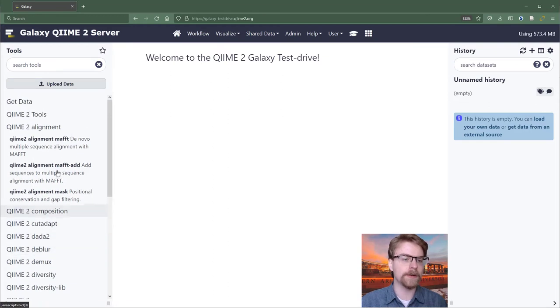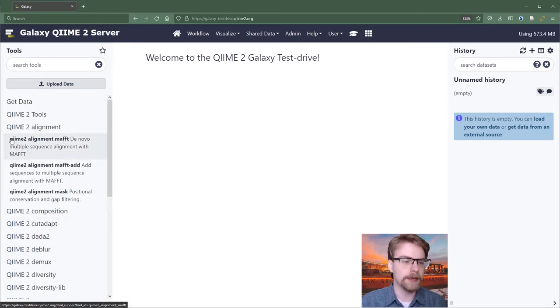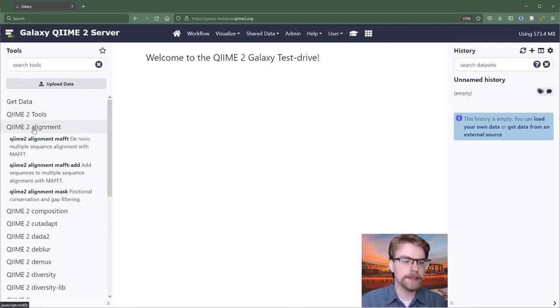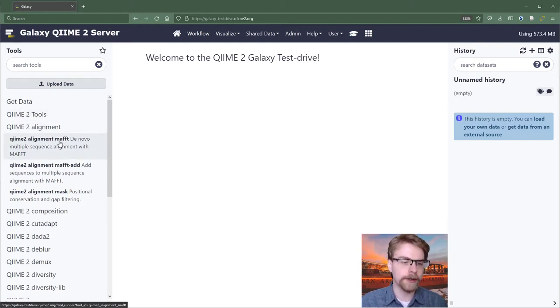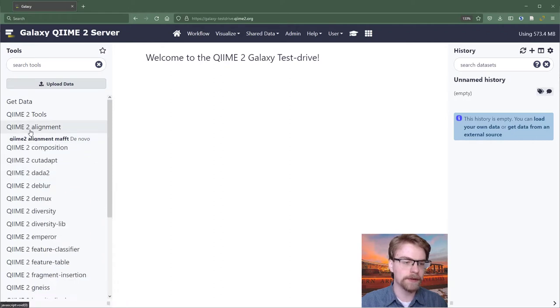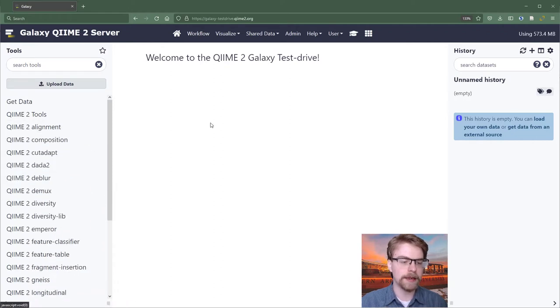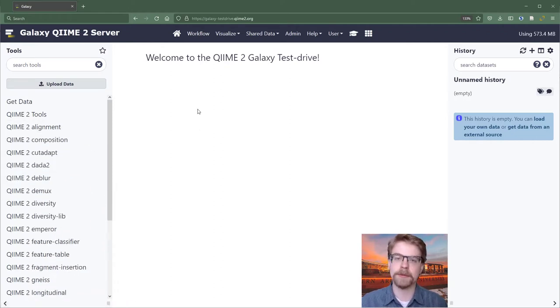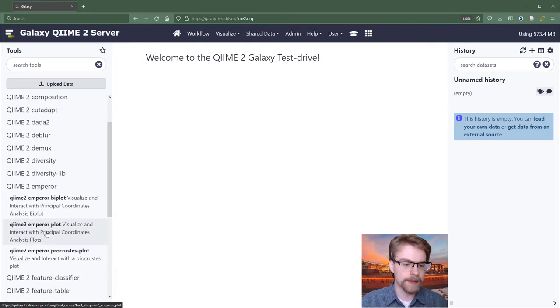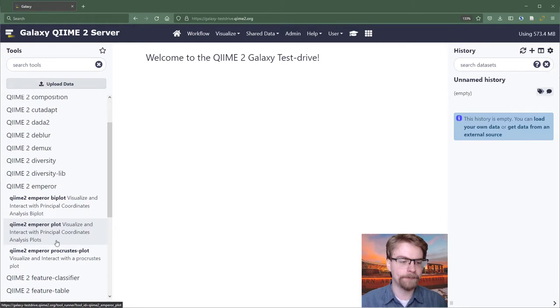If you're not quite sure where it is, a way to know is to look at the tool that you need. So maybe it would say QIIME 2 Alignment. It's going to be under this heading, QIIME 2 Alignment. And then you can find your action, which will be Maft, Maft Add, or Mask. If we needed, for instance, a QIIME 2 Emperor plot, we would scroll down until we find Emperor, expand that, and then we would click on Plot.